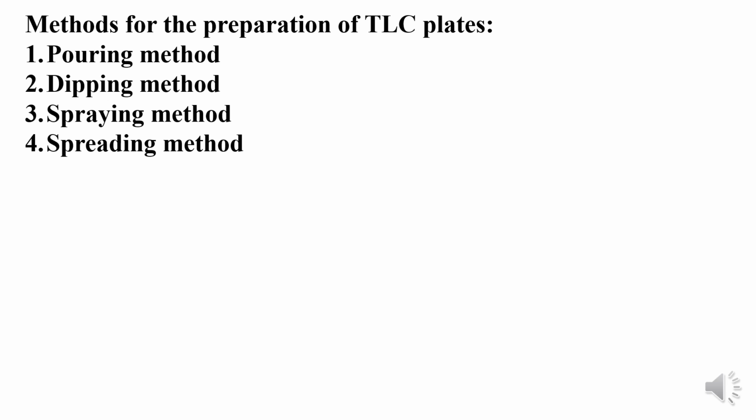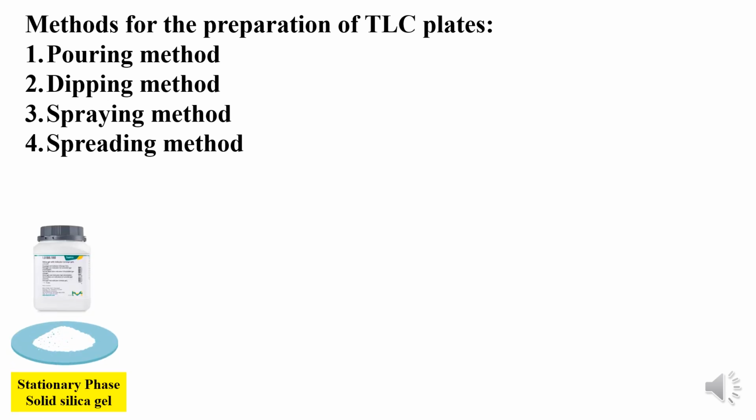Now in case of the pouring method, you have to pour the silica gel slurry. Now let's prepare the silica gel slurry. Now silica gel is a solid powder.